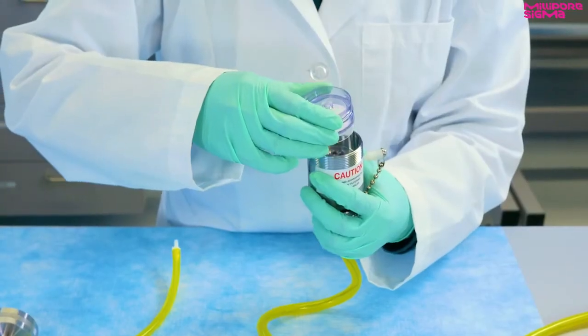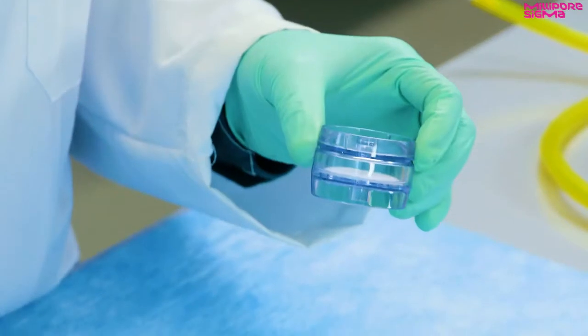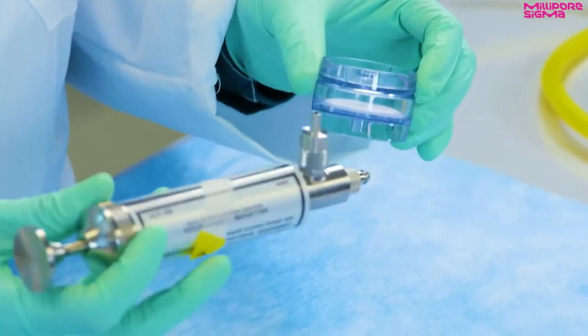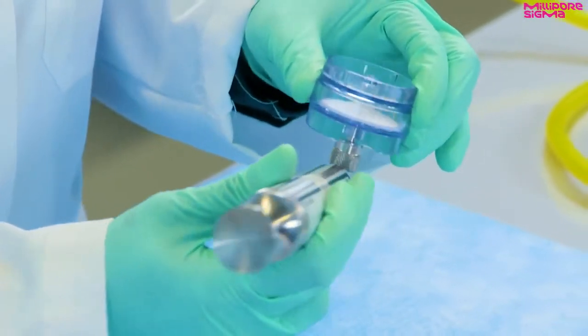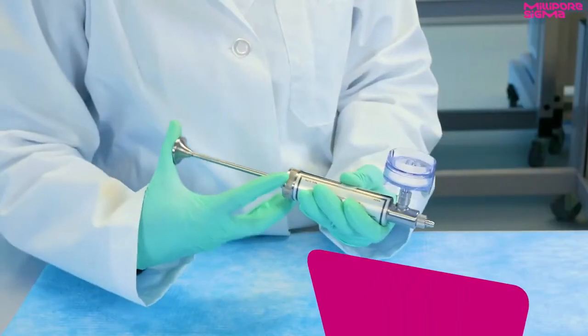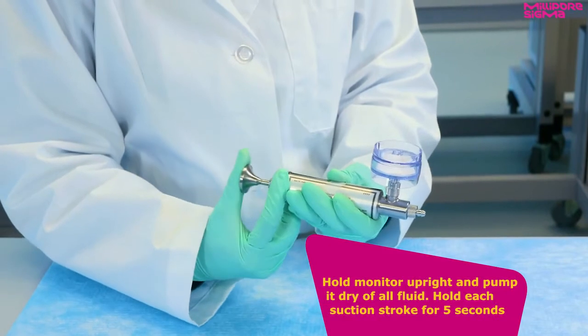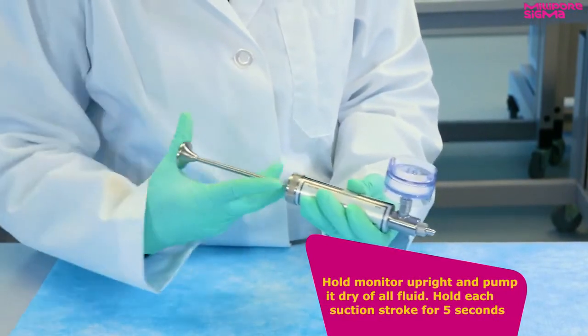Remove the monitor from the sampler. To dry the monitor, place the monitor onto the side port of the syringe with the spoke side down. Hold the monitor upright and pump it dry of all fluid. Hold each suction stroke for five seconds.